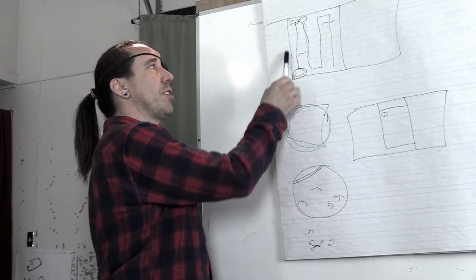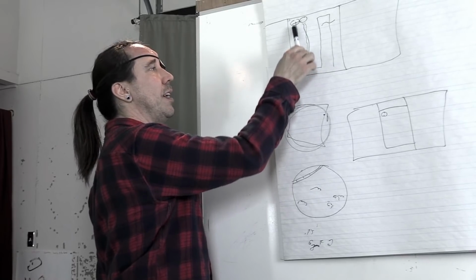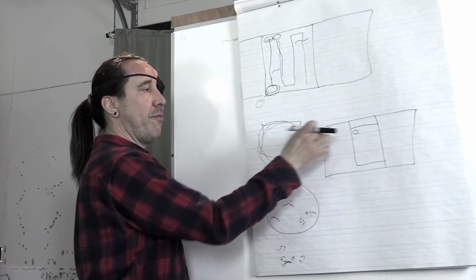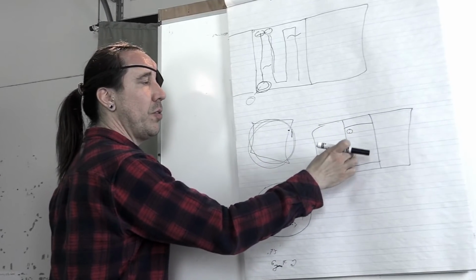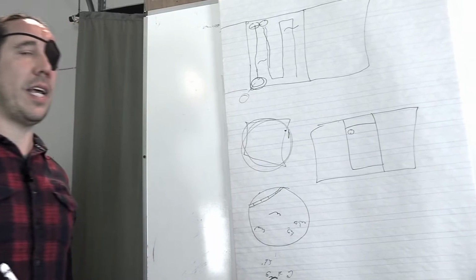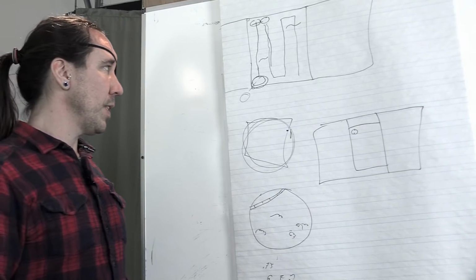And then when we're starting off to do a count, we're doing the nematode scan, and then we're going to zoom in, and this is at 400x. We're going to go through and do, say, 20 fields of view to take counts on what we're looking at. And then we'll move over to the microscope.